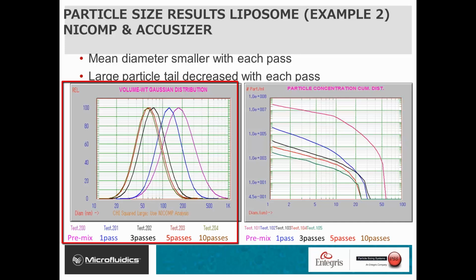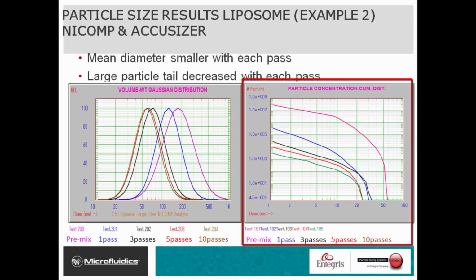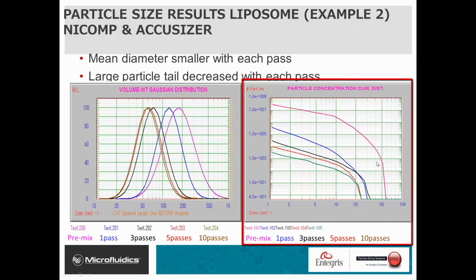Now, with the dynamic light scattering technique, we're drawing these Gaussian distributions. And you might think that there are no particles greater than, say, 500 nanometers or 0.5 microns, but there actually are a few. And if you really want to catch the percent or the concentration of particles that are larger than, say, a micron, that is what we're seeing on the graph on the right. So the graph on the right is actually looking at the tails of the distributions using the AccuSizer SPOS technique. This was using the LE400 sensor and the AccuSizer AD system.